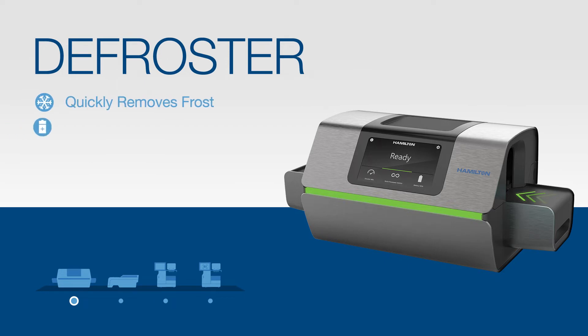The defroster is perfect for mobile use on a lab cart thanks to its small footprint and wireless functionality. With the device's revolutionary hands-free design, users will not have to handle harsh liquids or inhale noxious fumes during the frost removal process. The defroster, which is compatible with tube types up to 90 millimeters in height, accepts SBS format tube racks ranging in temperature from negative 20 degrees Celsius to negative 80 degrees Celsius. It is important to note there is no active warming so your samples remain frozen.